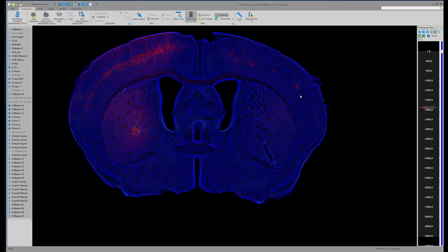Some methods compress in the dorsal-ventral dimension more than they do laterally, and so the atlas calibration allows for that adjustment. Once that's been done and we've established that, then we use the section registration workflow.